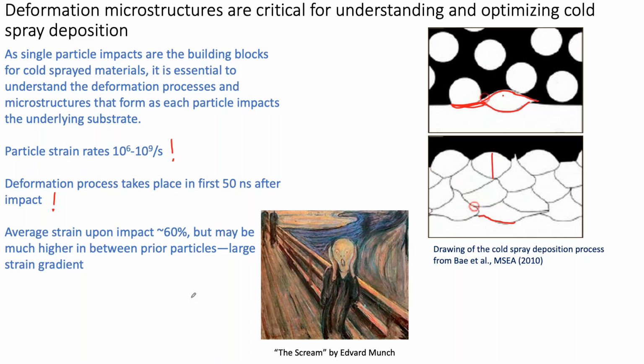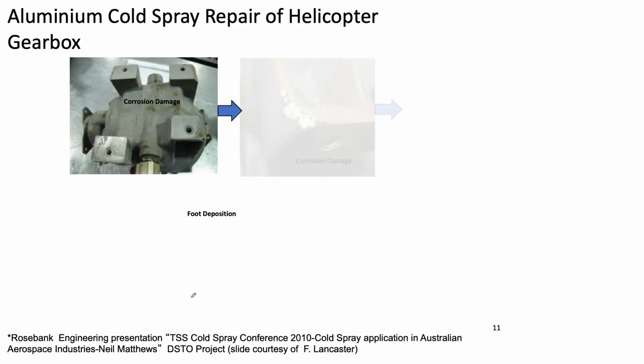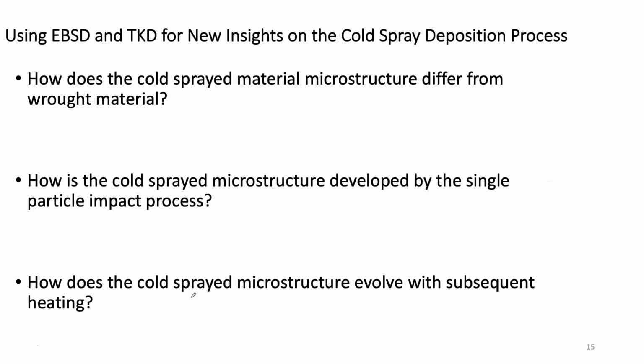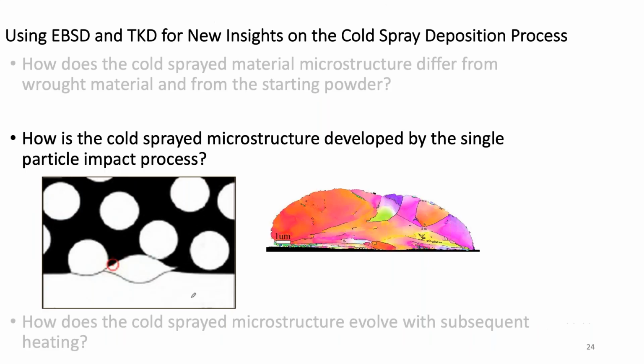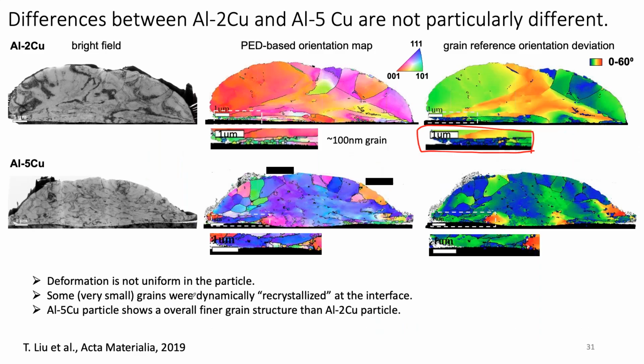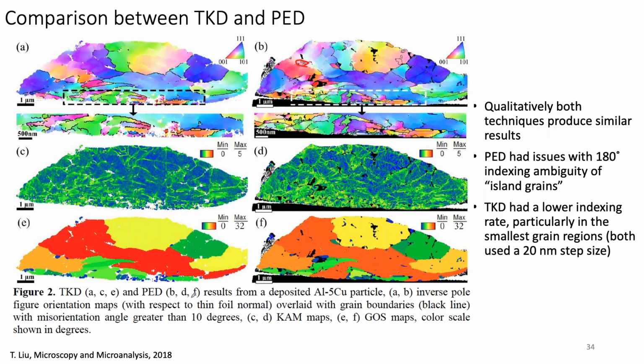Couple other questions. Do you get oxides formation in the particle interface? Sure, great question. So you do not get oxide formation during normal cold spray. I've not seen that. And again, in this work on single particle interfaces, we actually went in and did high-res microscopy, TEM and some microanalysis.